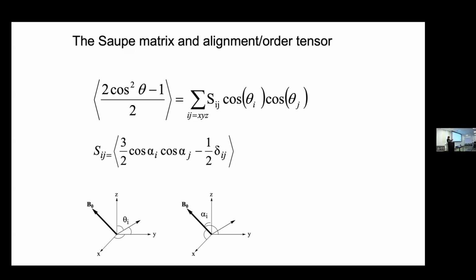Why is it 2? Okay, so theta and phi tell me where this is. But what about this angle? For the general case, it's always 3. If it was axially symmetric, if X and Y were the same, then I just need to define theta and phi. But there are always 3 Euler angles, in the most general sense, required to define the orientation of the tensor relative to the molecular fragment. And as I said, each one of these vectors has a certain length.